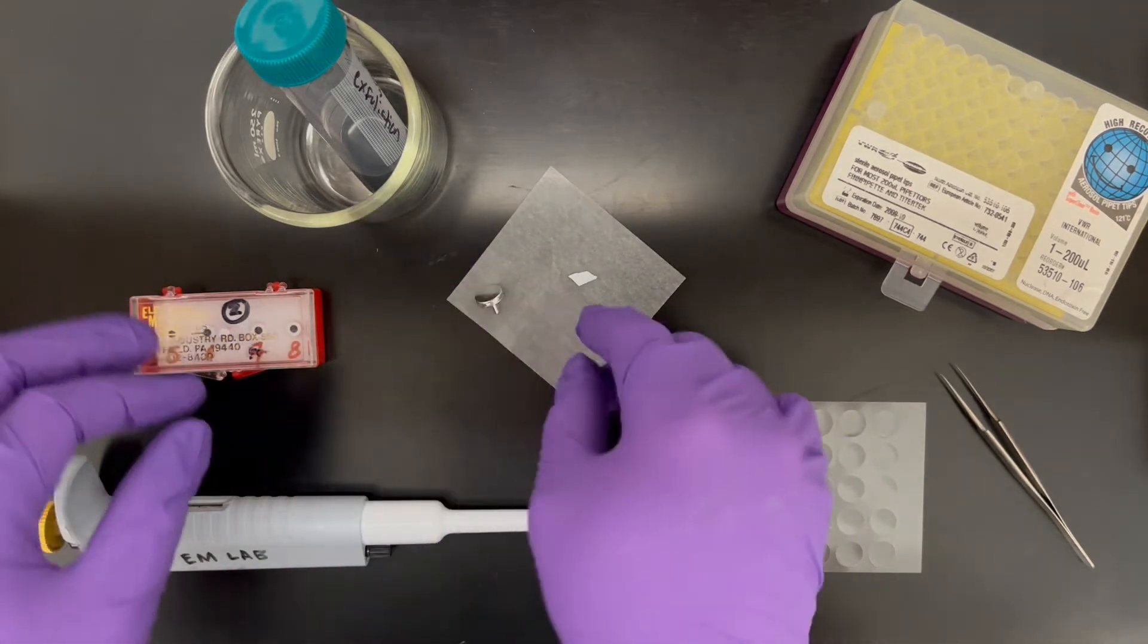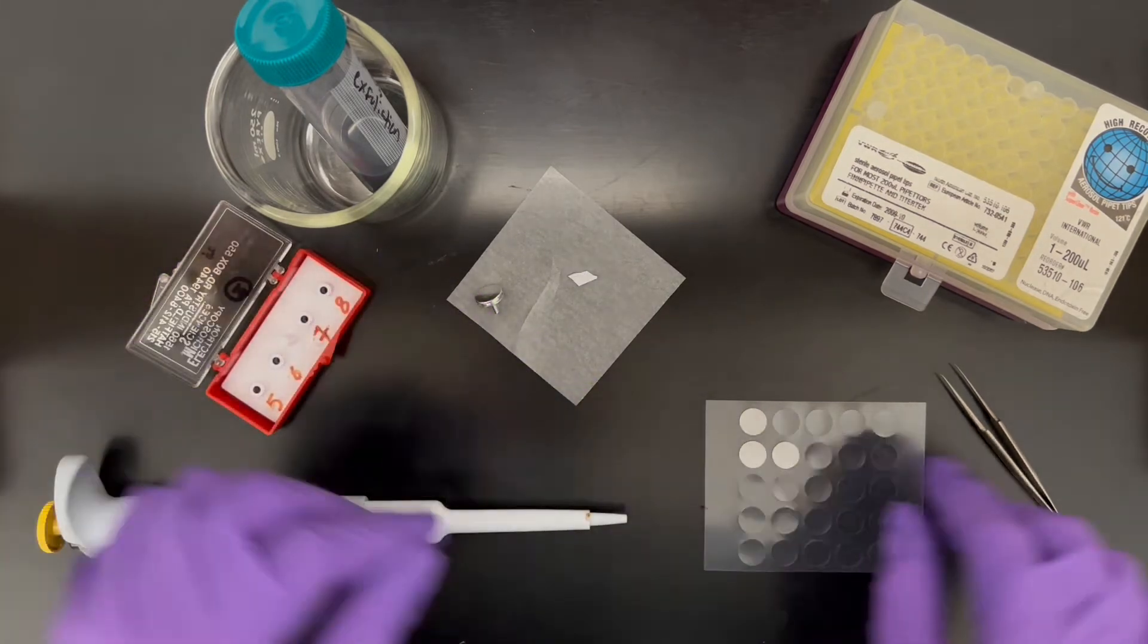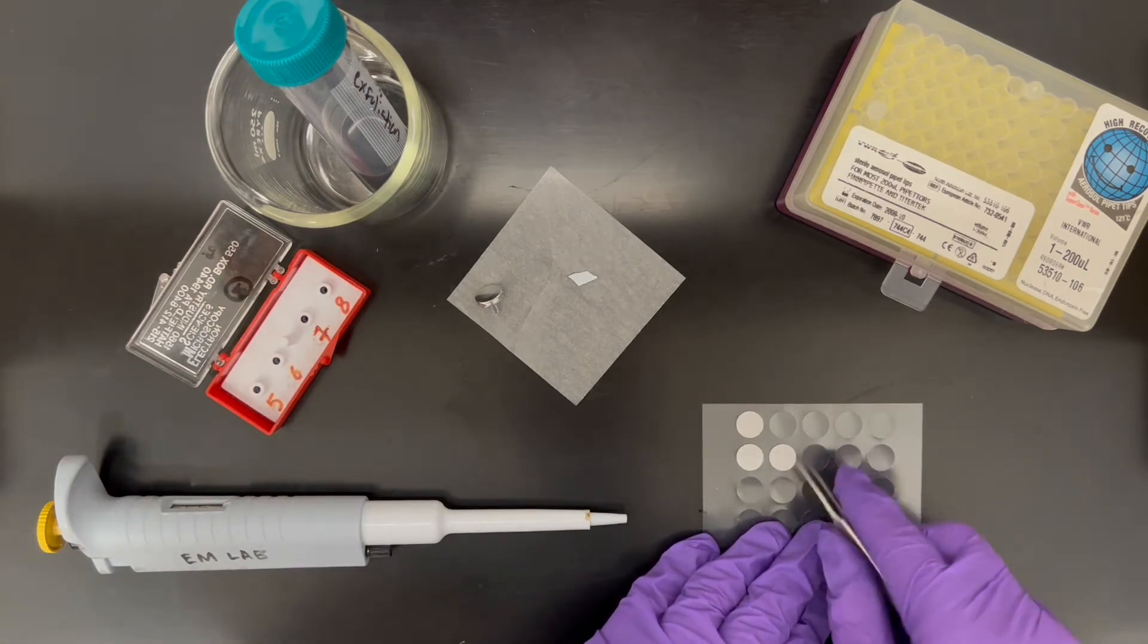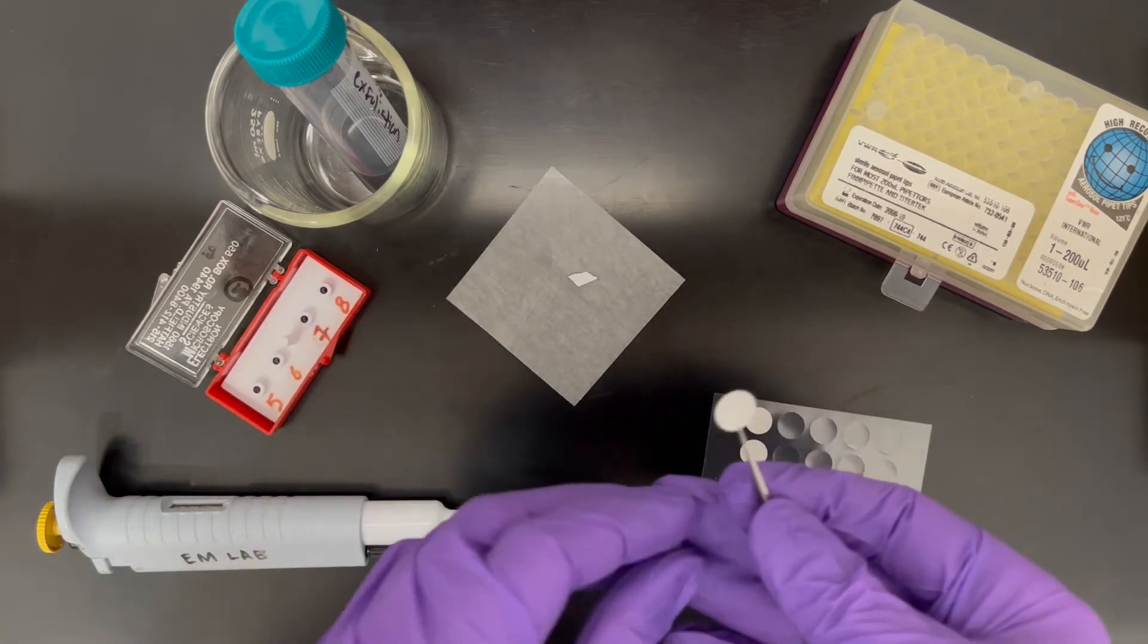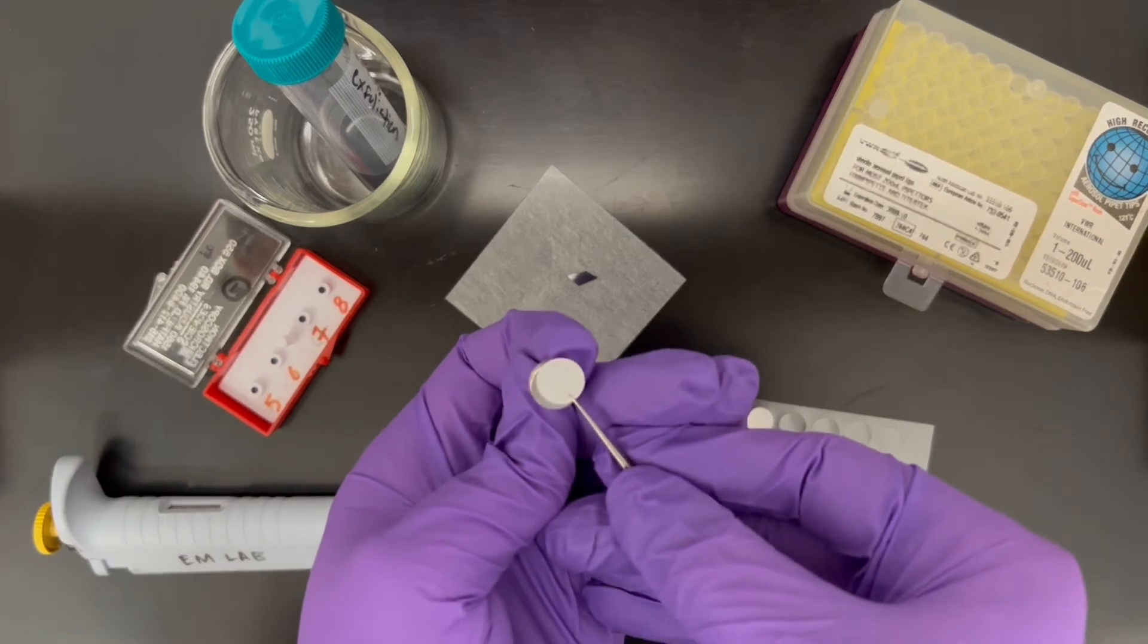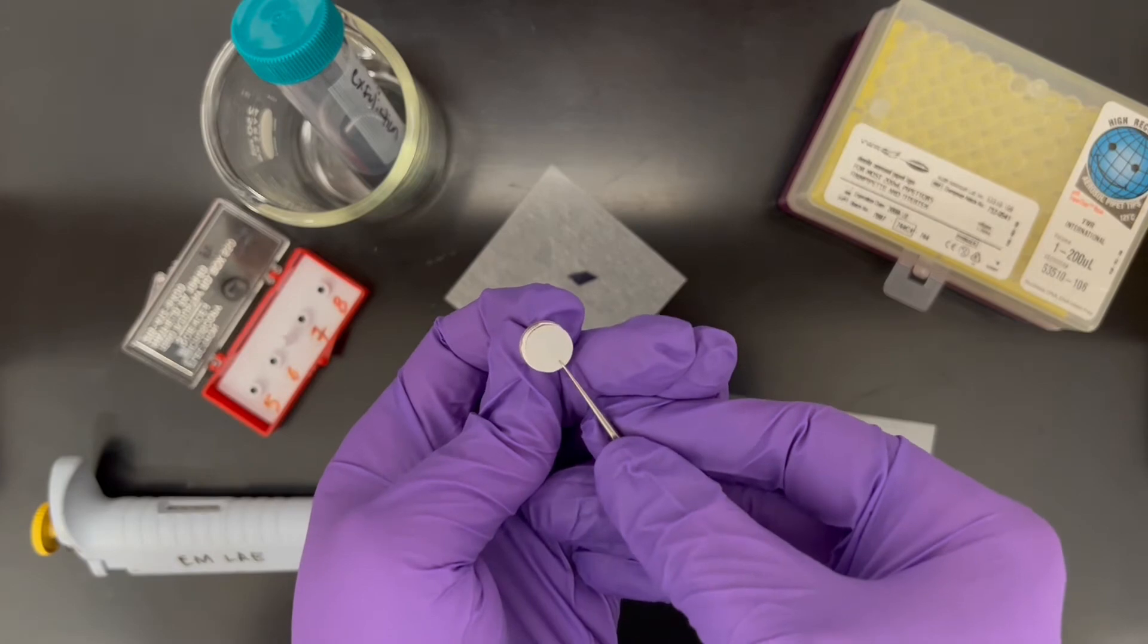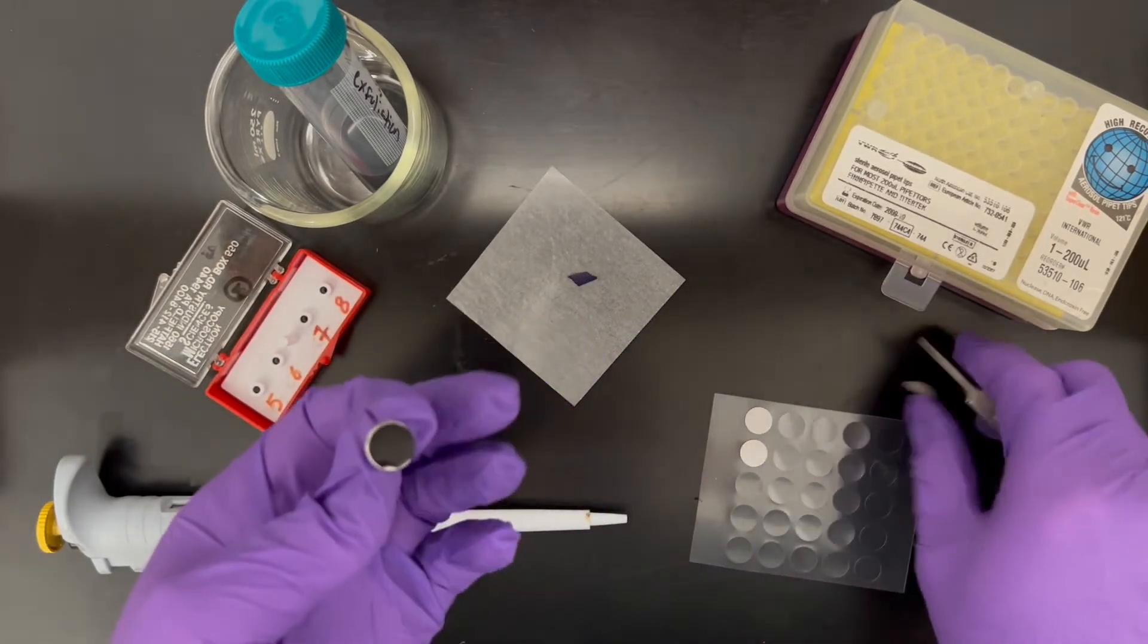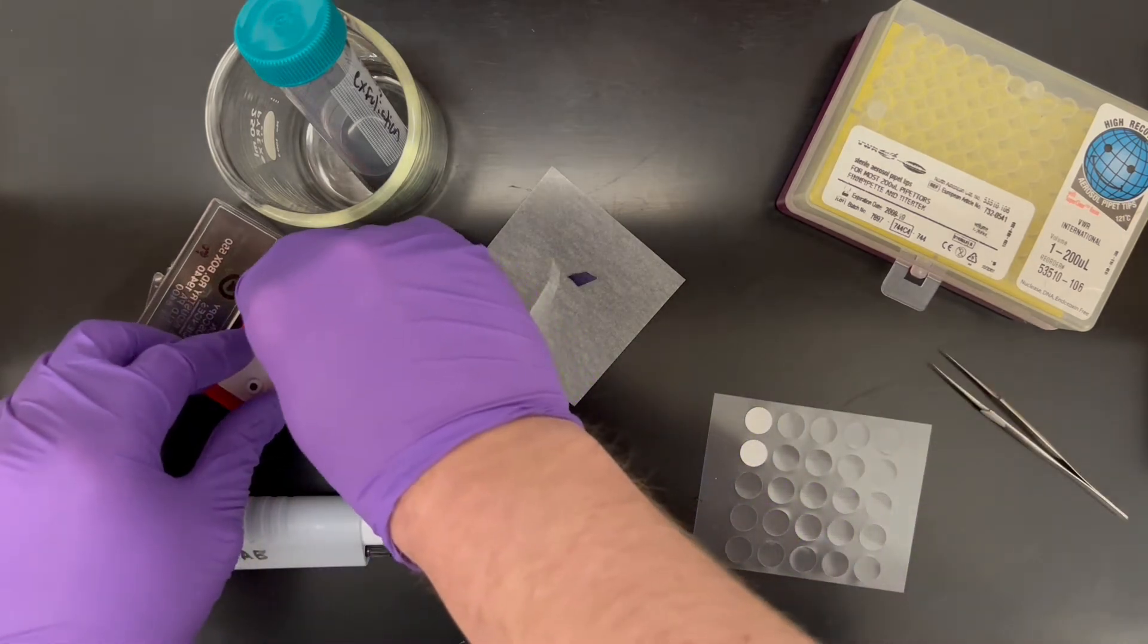In the time that that is settling, we're going to open our specimen box, get our carbon sticky tab, apply it to the stub, and put it in the box.